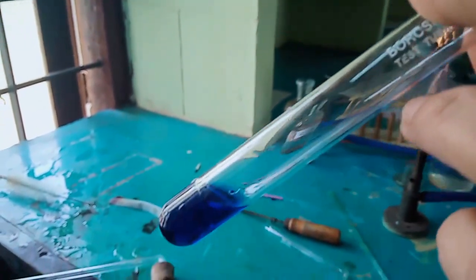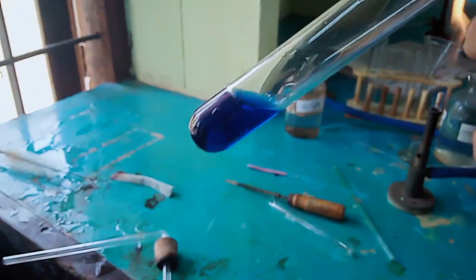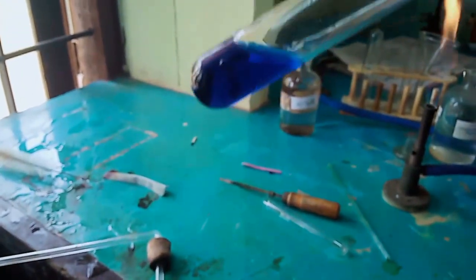So this is the test for ammonia gas: on passing ammonia vapors through copper sulfate solution, first we get a pale blue precipitate, and on passing excess ammonia through the same solution, a deep blue solution is obtained.